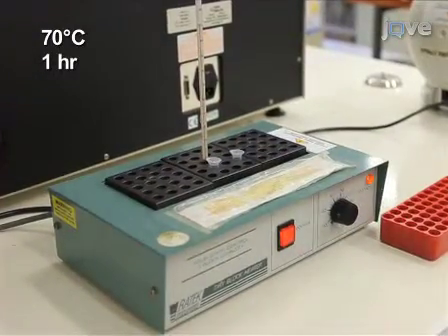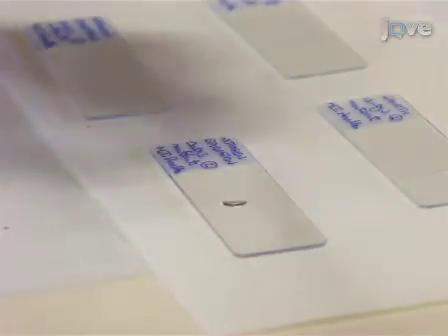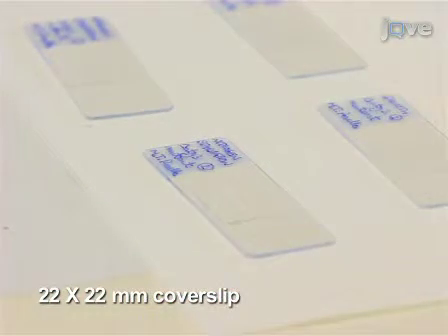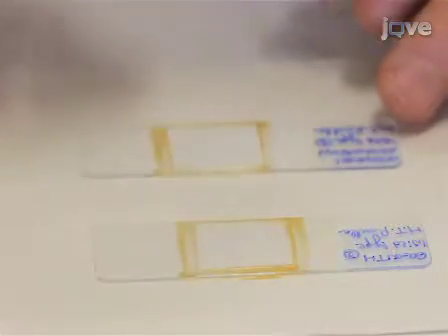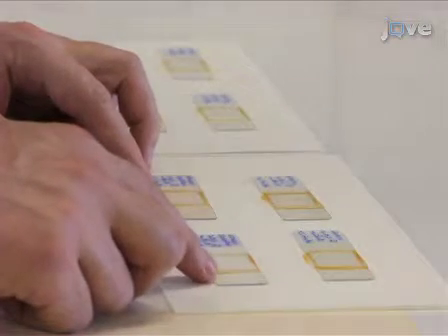The molten agarose is maintained at 70 degrees Celsius. To mount the cells, spot 20 microliters of molten agarose onto a labeled 76 by 26-millimeter glass microscope slide. Immediately spot 10 microliters of the washed cell suspension onto the agarose bed. Cover the agarose bed with a 22 by 22-millimeter glass coverslip; the cells will spread across the agarose surface beneath the coverslip. Then carefully seal the edges of the coverslip with a thin film of nail polish to prevent dehydration and movement during imaging. When the nail polish is completely dry, the slides are ready to be viewed by fluorescence microscopy.